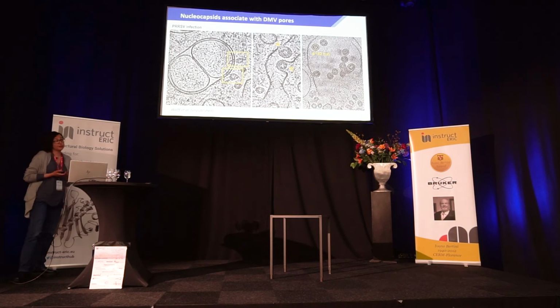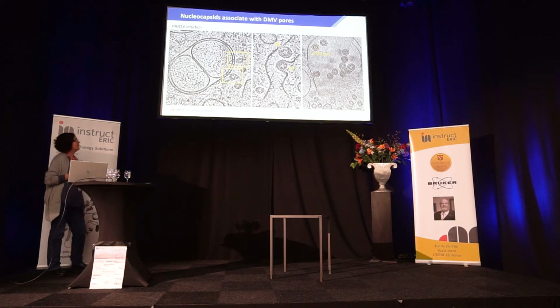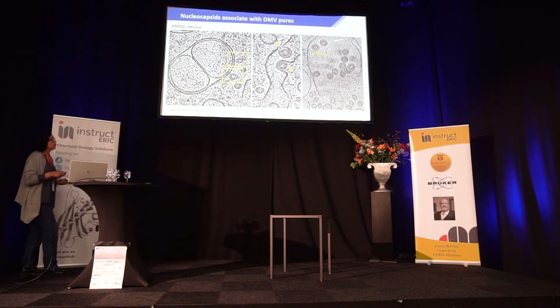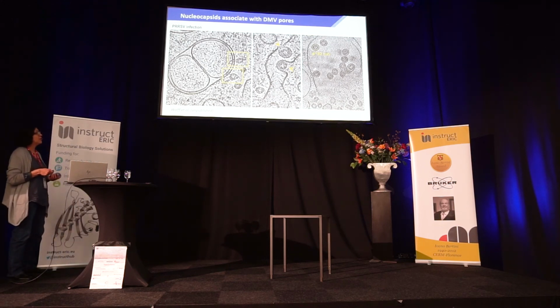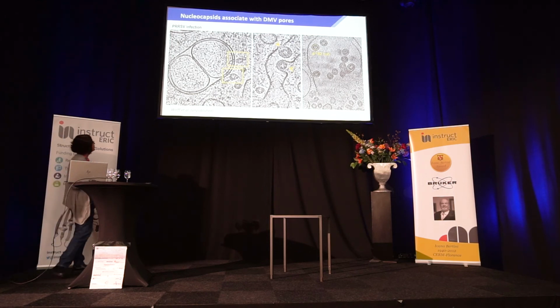A very, very interesting observation for us was to see that about 20% of the pores seem to be associated with these structures, which are very distinct and easily recognizable as nucleocapsids, which we also see in other regions of our tomograms, budding into membranes of the secretory pathway or already budded inside these compartments, with the dimensions and features that fit previous descriptions of these virus particles.